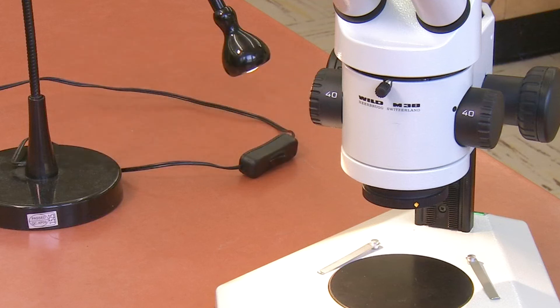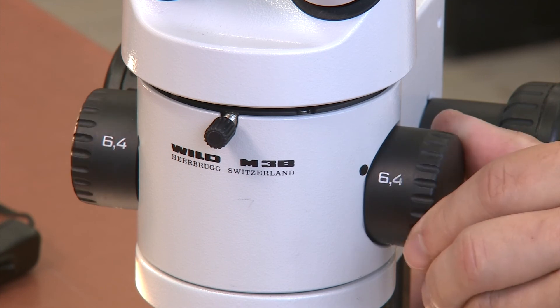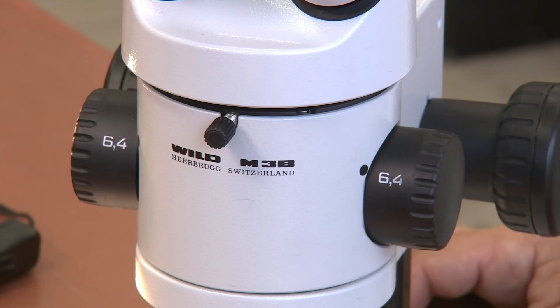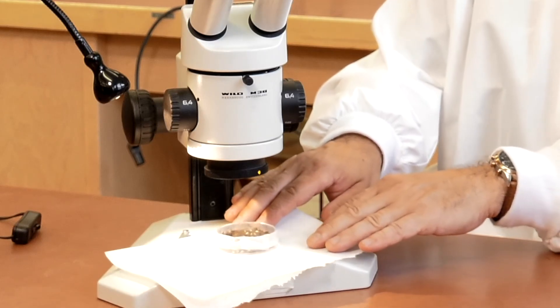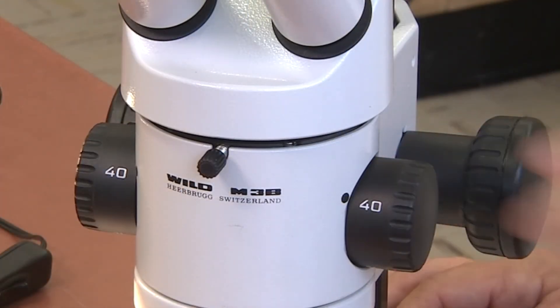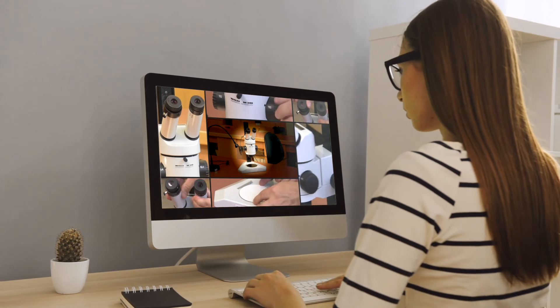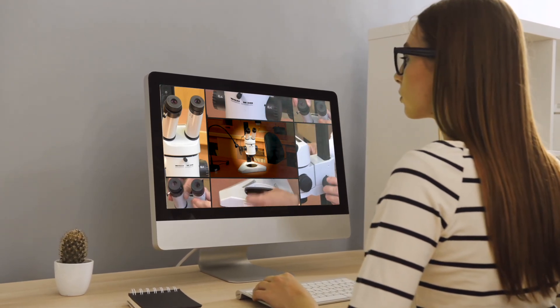Some dissecting scopes may have a built-in light source or a continuous zoom to go between magnifications instead of distinct levels of magnification. As with the compound microscope, it is easiest to begin on low power, center your specimen, bring it into focus, and then move on to higher powers. If you have any issues with your own microscope, either watch this video again or ask a TA or instructor for assistance.